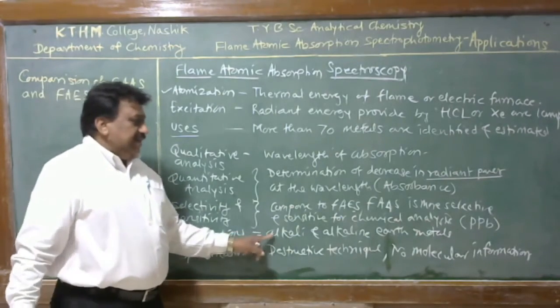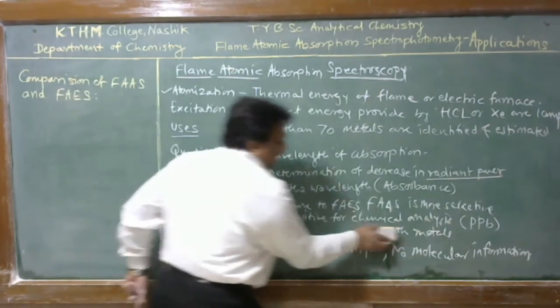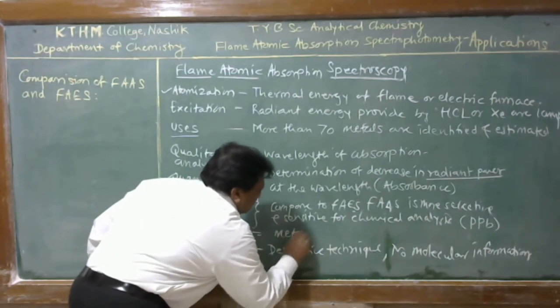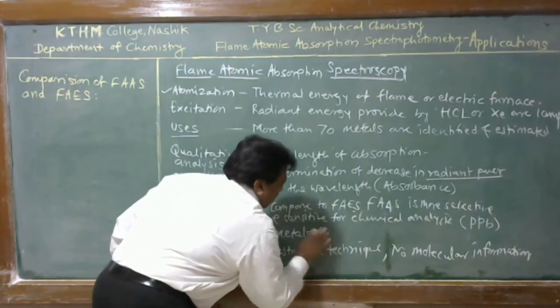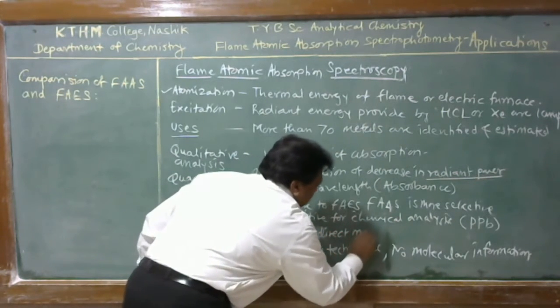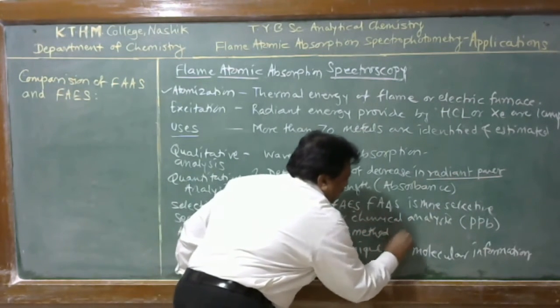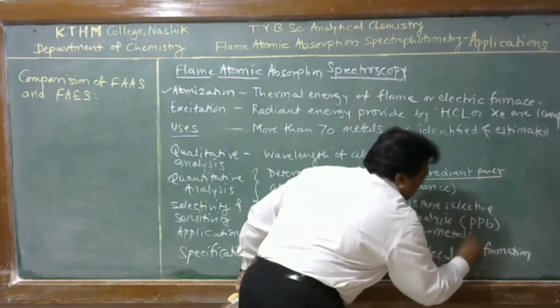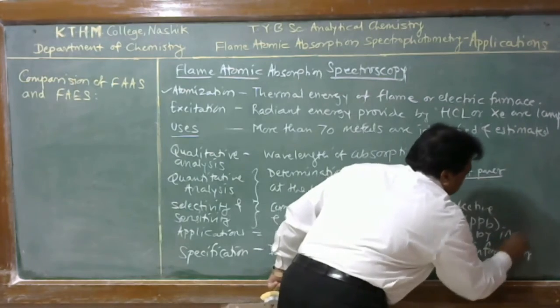Again, it is specifically useful for metals by the direct method and non-metals by the indirect method.